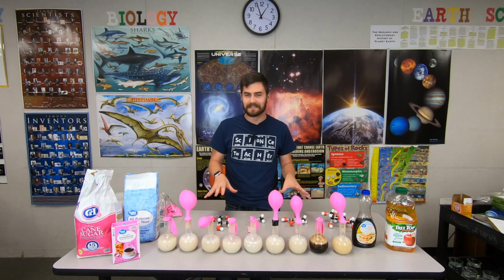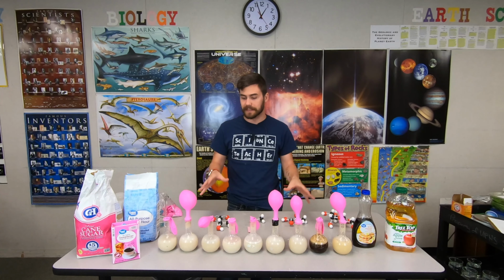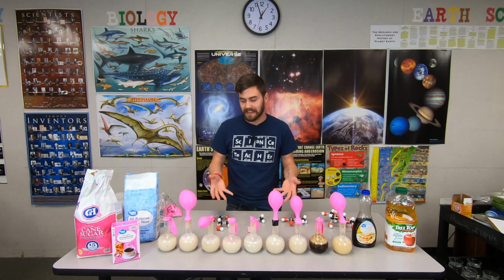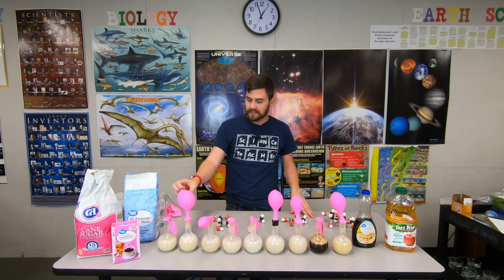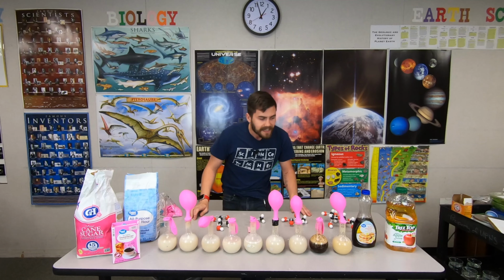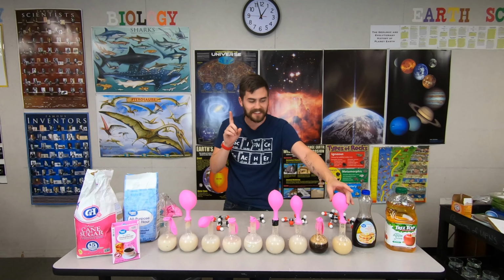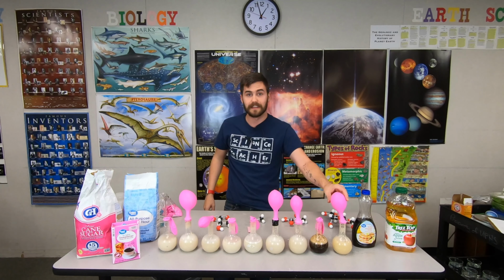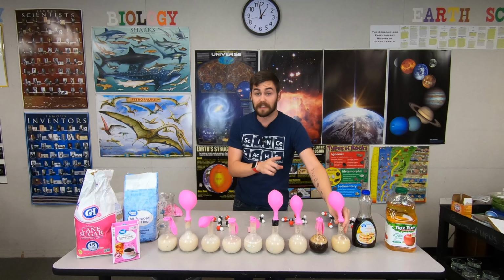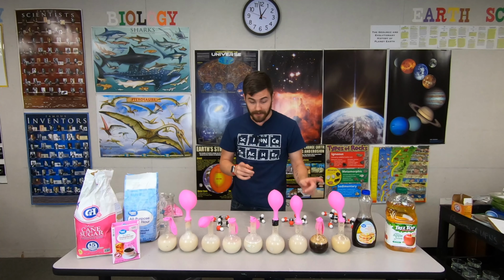Okay, we're gonna call the experiment finished at this point, and the results do surprise me a little bit. Now, let's try to hypothesize what's going on here. First, let's rank these in order of gas production. The flask with 10 grams of table sugar produced the most gas, and then second place, I'm gonna call these a tie. It looks a little bit like the apple juice balloon is a little bit bigger. So that had 23 grams of carbohydrate, I think fructose or sucrose, not 100% sure.